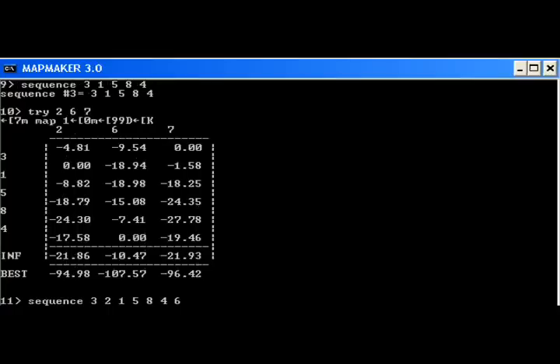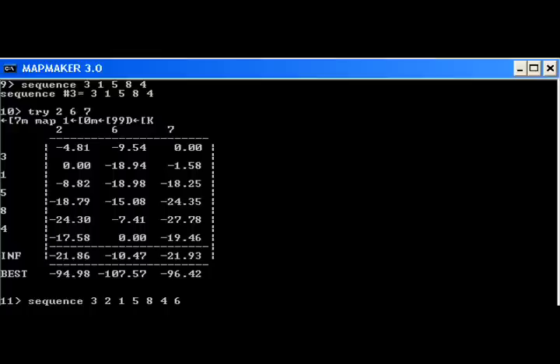Sequence 3-1-5-8-4 command tells the program to set this exact order. The try command tries to place the remaining loci, that is 2, 6, and 7, into the map based on the LOD values. Thus 2 is placed between 3 and 1, and 6 is placed at the end after 4.